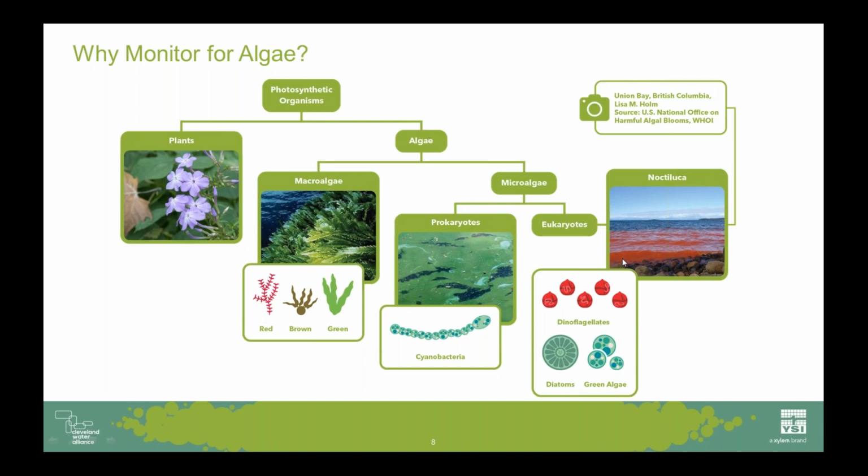Now, personally, I divide the microalgae even further into the blue-green algae, which if you're a scientist, you know are called cyanobacteria. And occasionally you'll hear me mention them. I think the key thing there is that these are bacteria, not algae, even though they do photosynthesis like algae. And that's why we always call them algae and refer to them as blue-green algae.